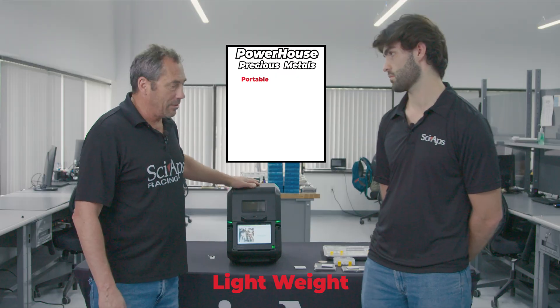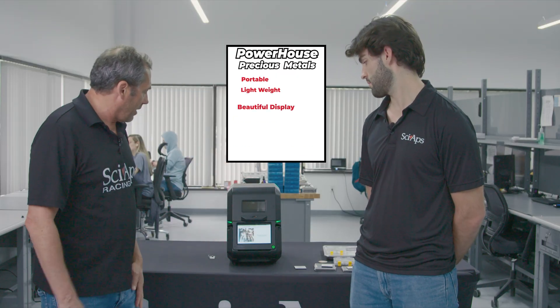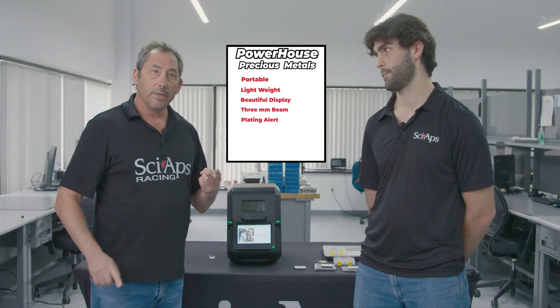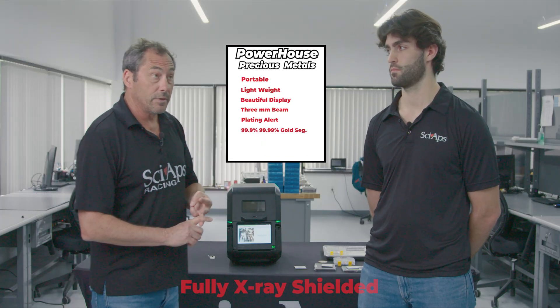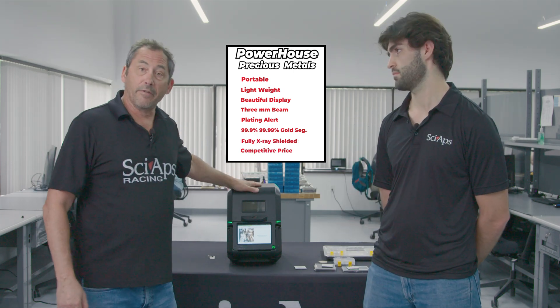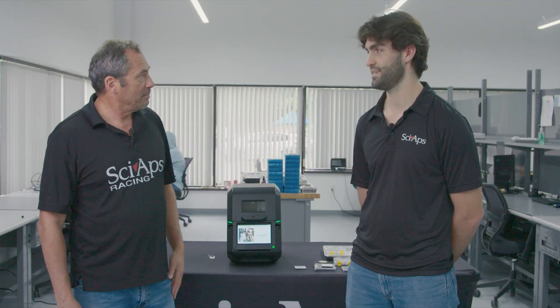So, portable system — weighs about 10 pounds, very light, very portable. Beautiful display. It's got the three millimeter beam collimated down, plating alert, three nines and four nines gold segregation, and fully x-ray shielded — so fully safe. All at a very competitive price to the other systems on the market. Good job buddy. Thanks. Excellent work.